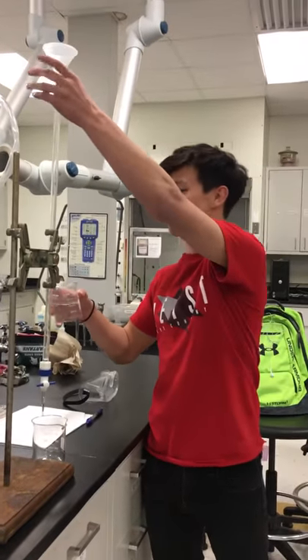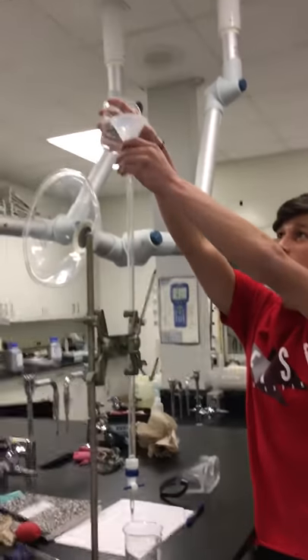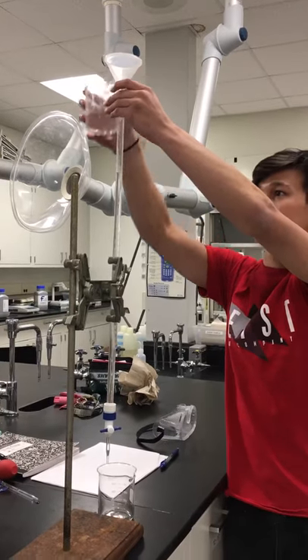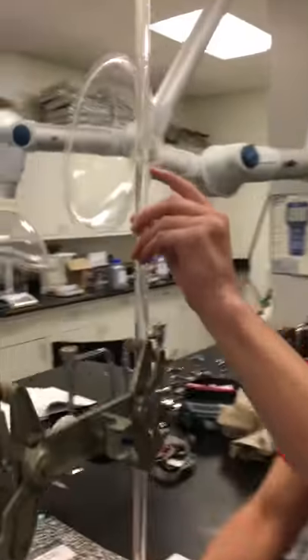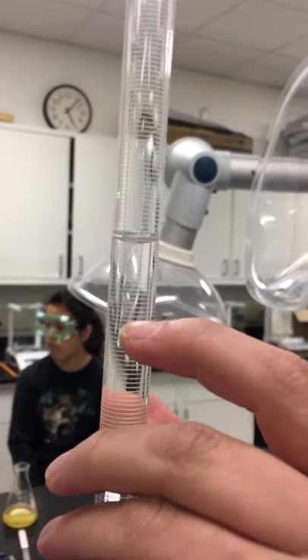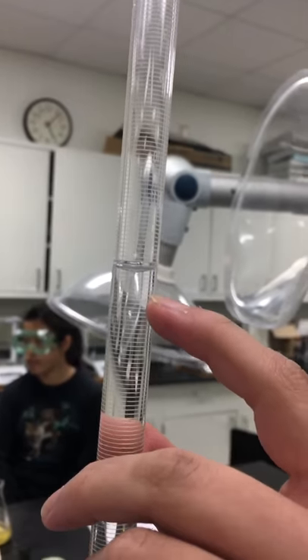So, we have the funnel up here, and we have our buret that we pour to our desired amount. And the meniscus is at 12.8... oh no, that's 12.6.